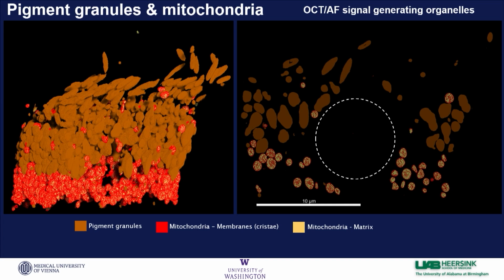Here's a different model I did. I was a bit of a modelholic, and kept training new models to do new things. This one, I wanted to look at the internal structure of the mitochondria, which you can see on the bottom. You can see our model was able to quite accurately label the cristae and the little shells within the mitochondria.